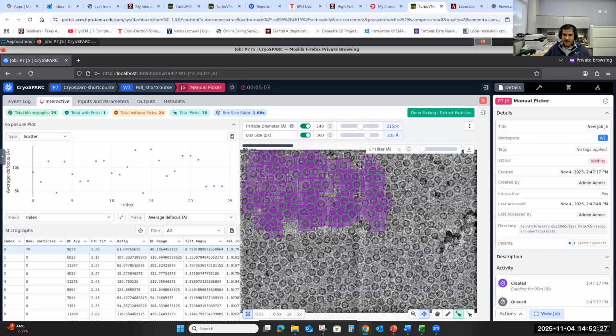So usually for a sample like this, if you have a large one like the apoferritin or virus sample, maybe 500 to 1,000 particles may work. But for some other small proteins, you might need more, at least a few thousand particles. That's a little bit of a pain. For this kind of sample, we can pick the particles from around 500 or something.